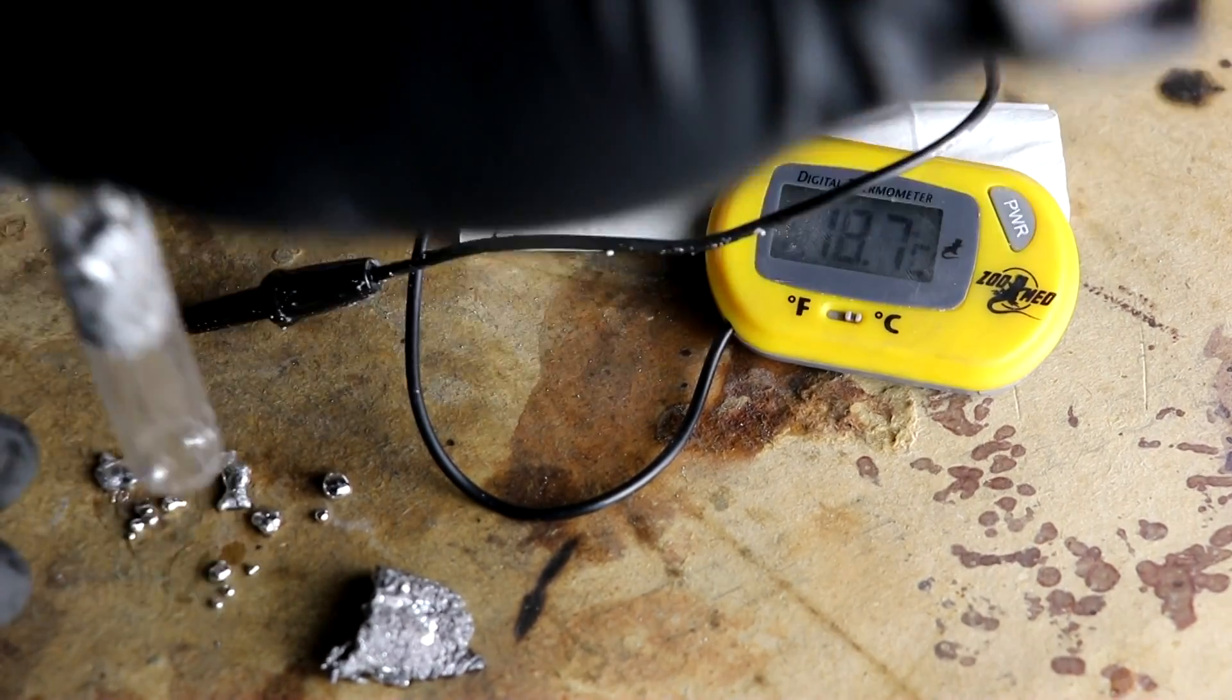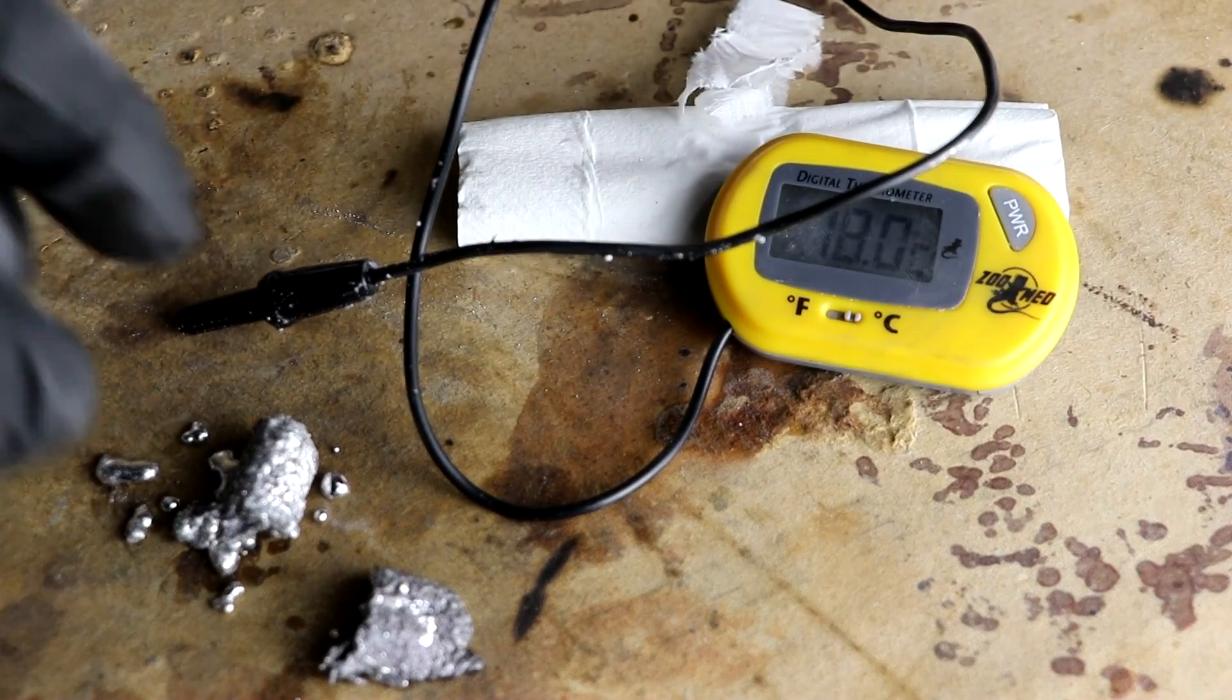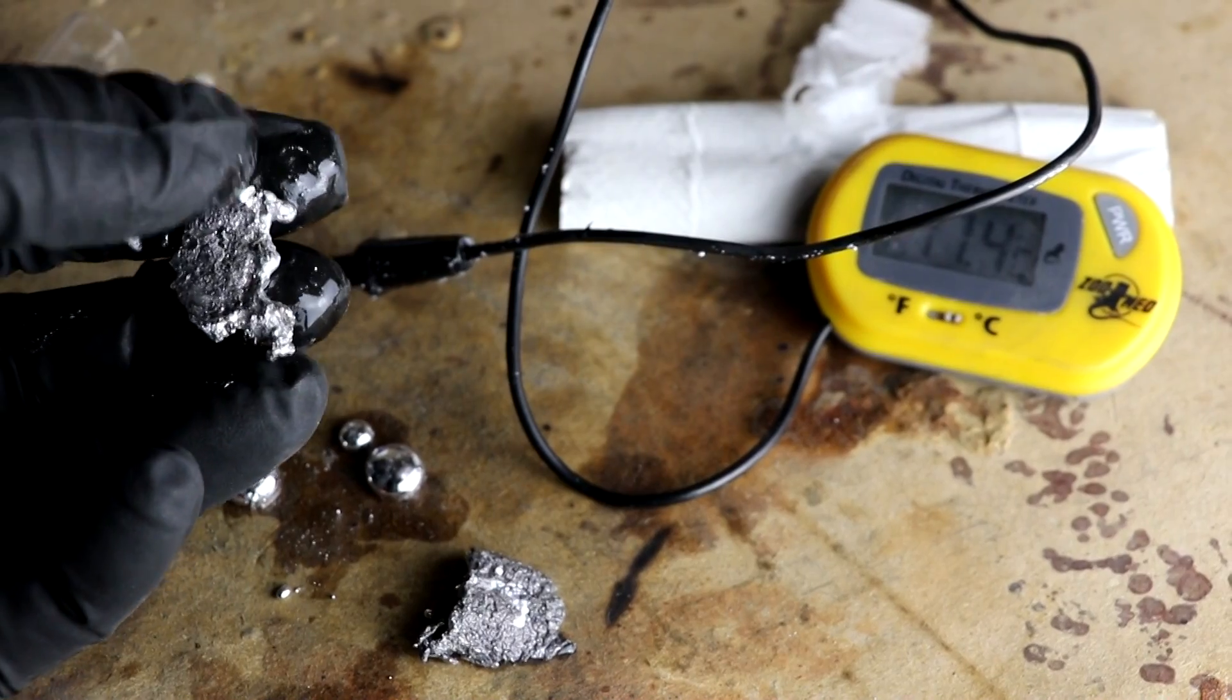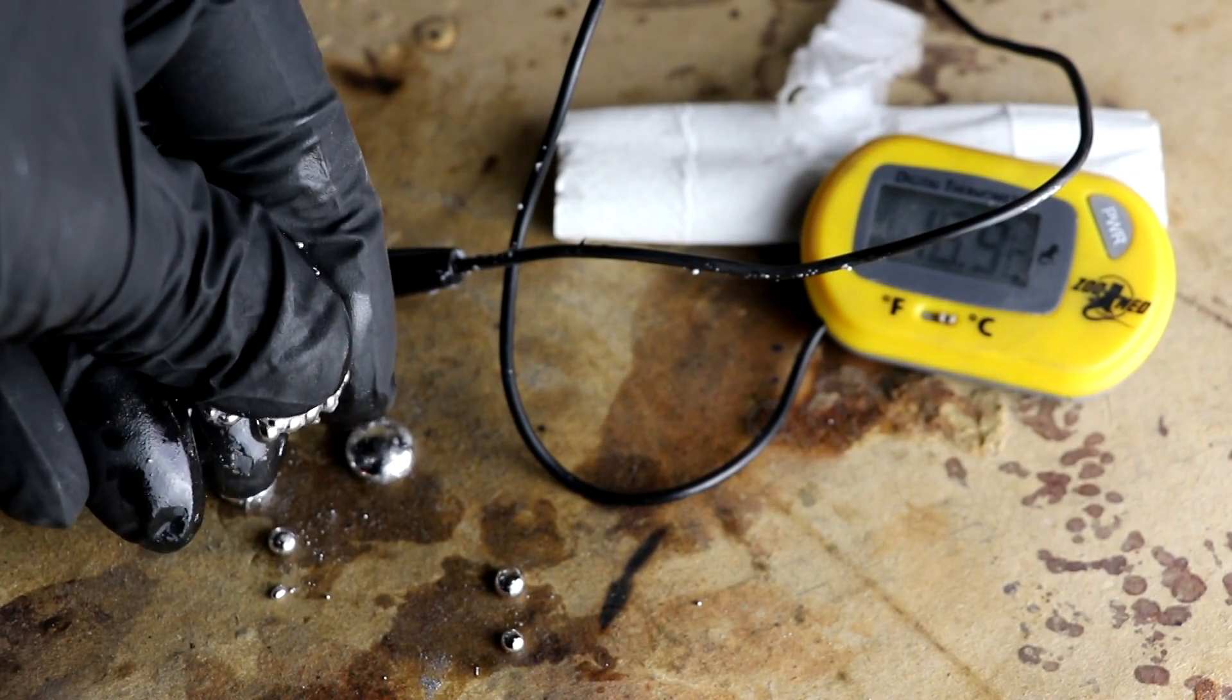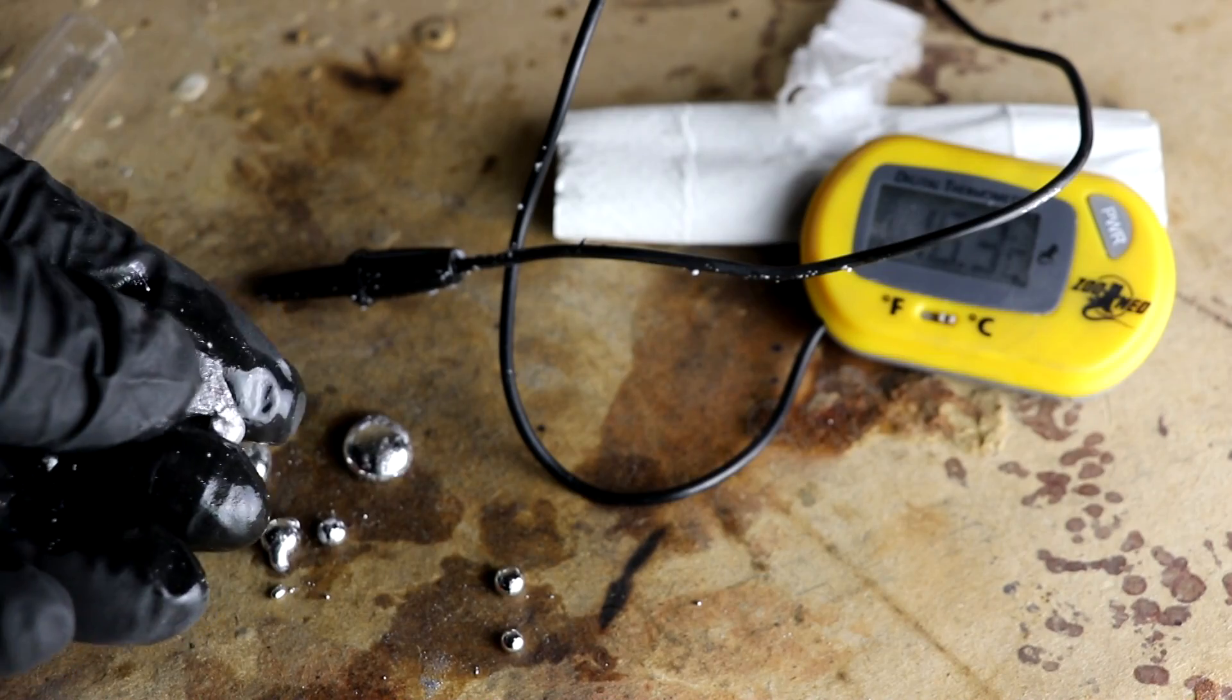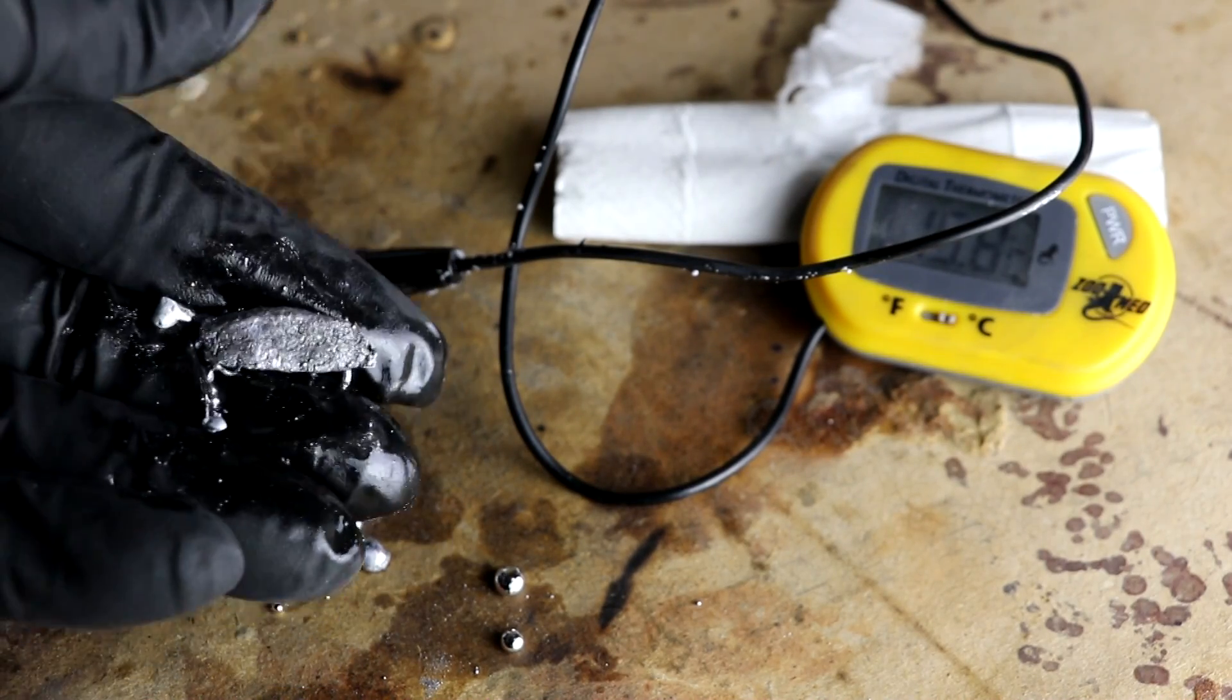See if we can get this sodium potassium out of there. There we go. I should be able to actually give this a squeeze and squeeze out that metal. So yeah, I'm squeezing out the gallinstan and I'm retaining whatever it is that is reacted. So it's probably a gallium, sodium and potassium alloy here which is not liquid.